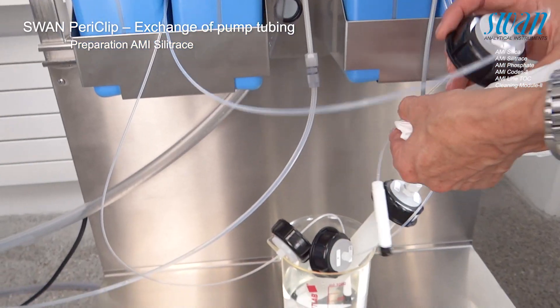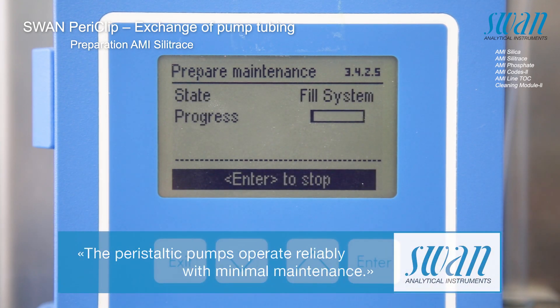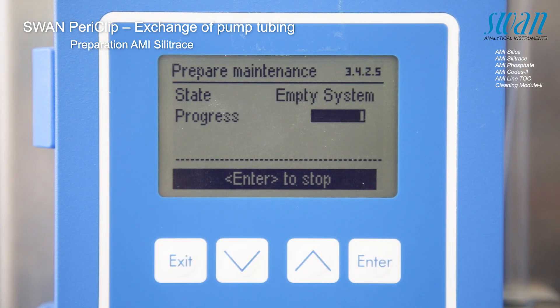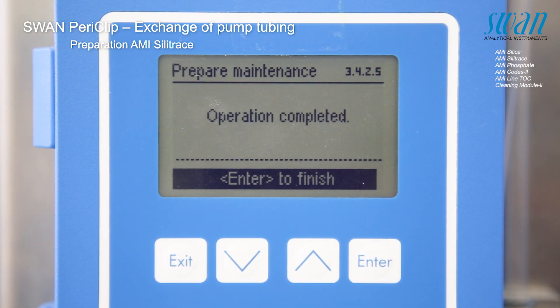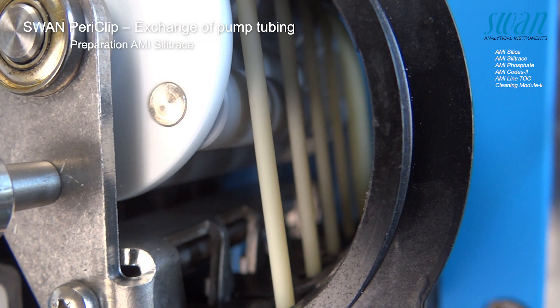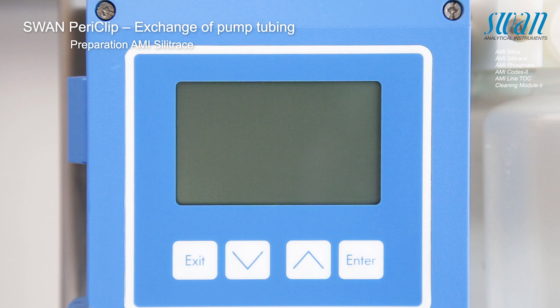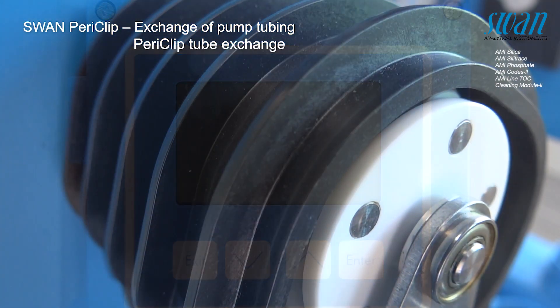Place the suction lances in the bucket with demineralized water. After the pump has stopped, stop sample flow. Shut off the power for the instrument. The instrument is now ready to have the pump tubes exchanged.